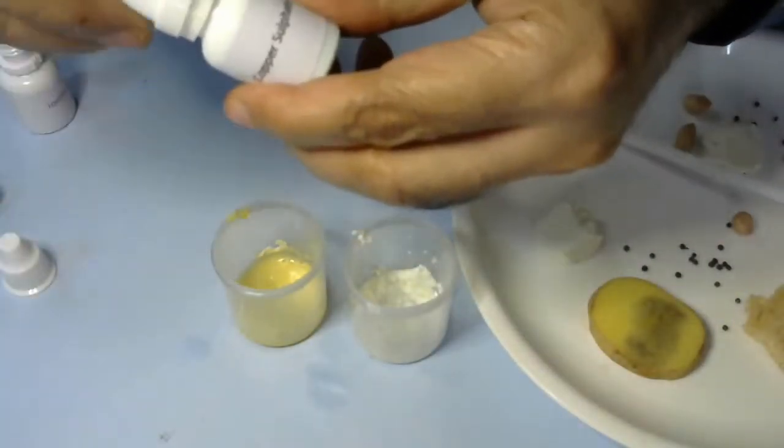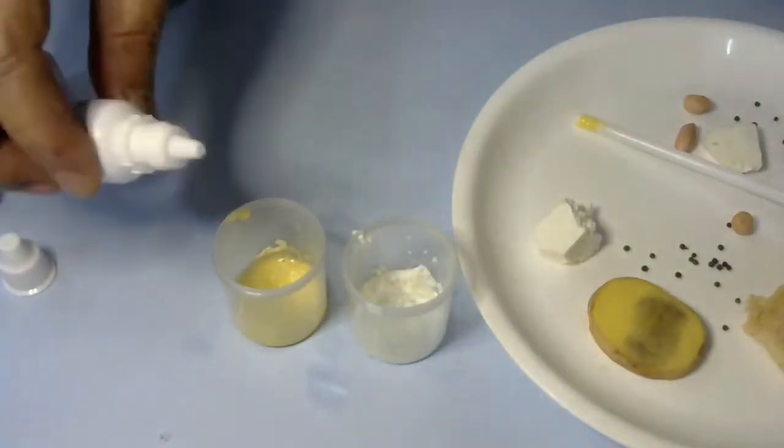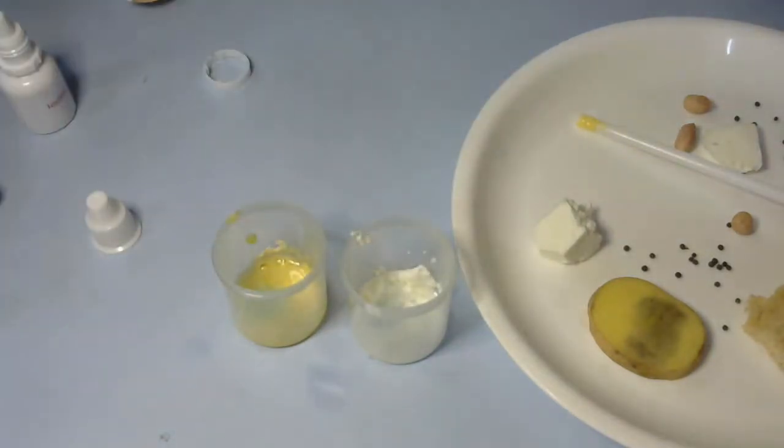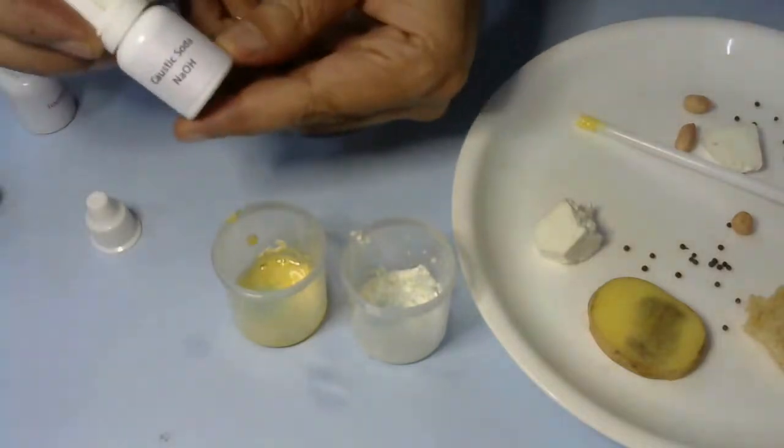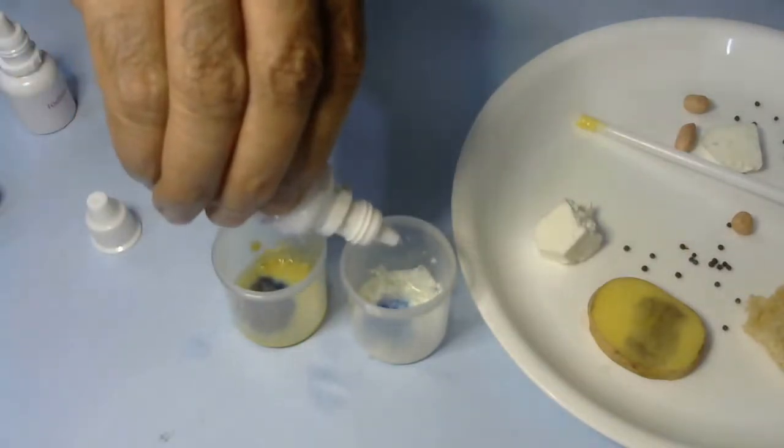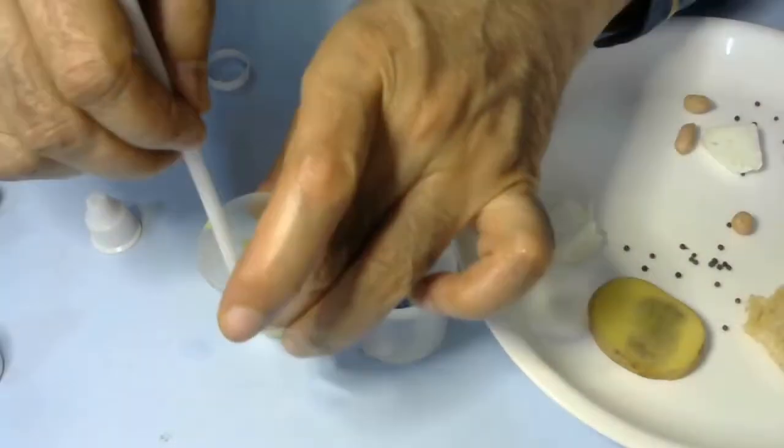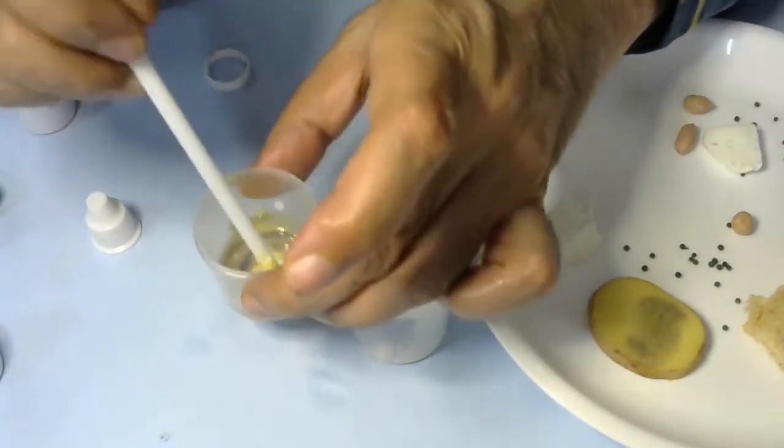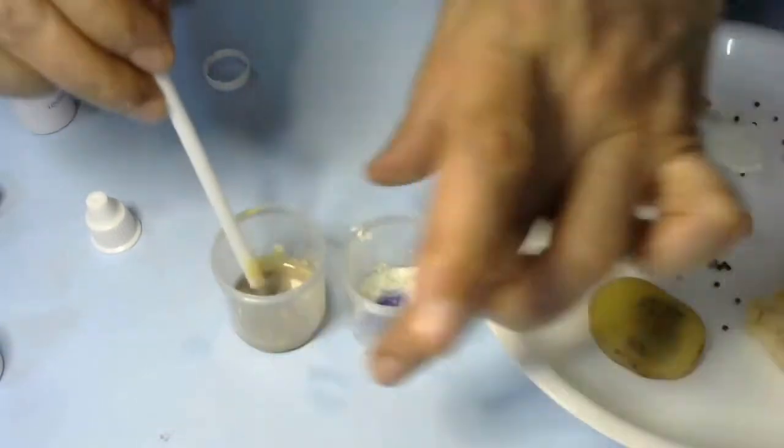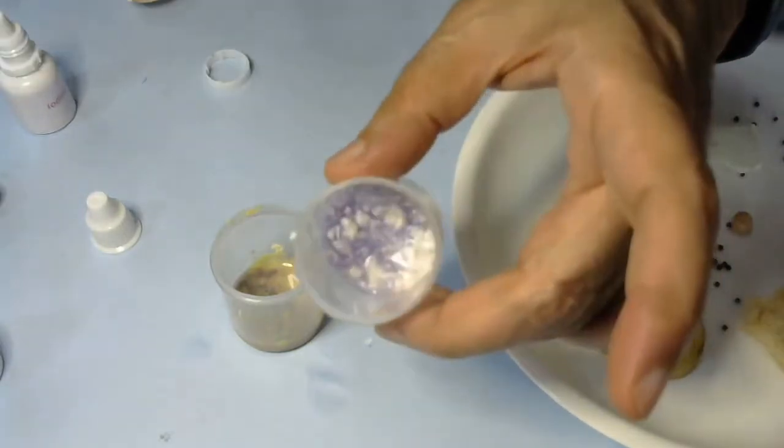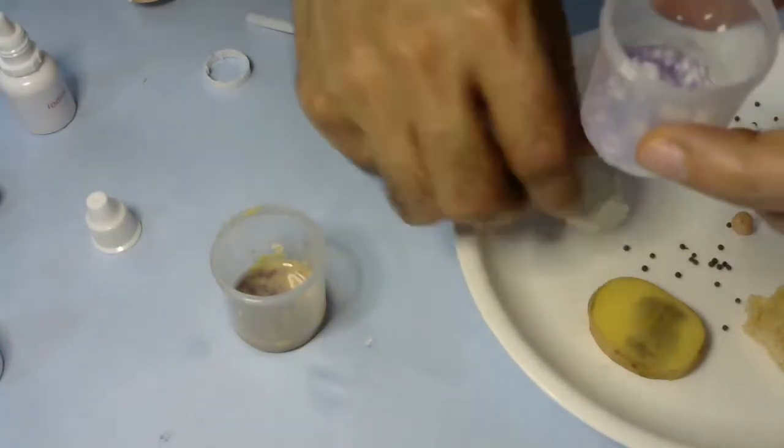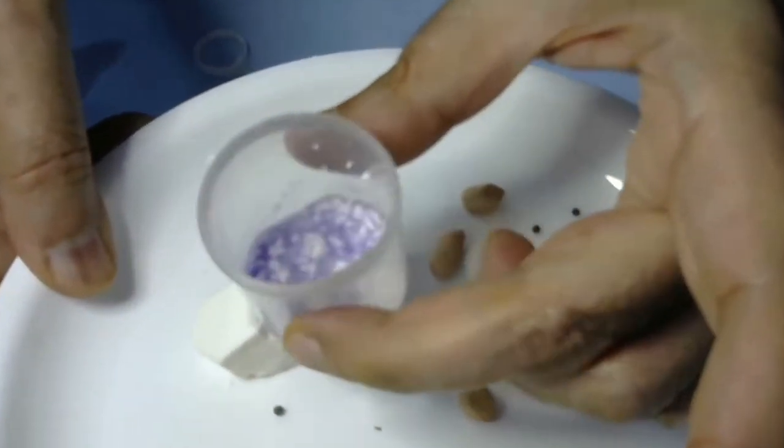For testing, first we'll put copper sulfate solution. Add only two or three drops in both of them. After that, we have to put about 10 drops of caustic soda solution. Now we'll mix them. If our food sample contains protein, the solution should turn purple or violet. You can see instantly after putting these solutions, the paneer has clearly become purple. In white background you can see clearly it has become purple.